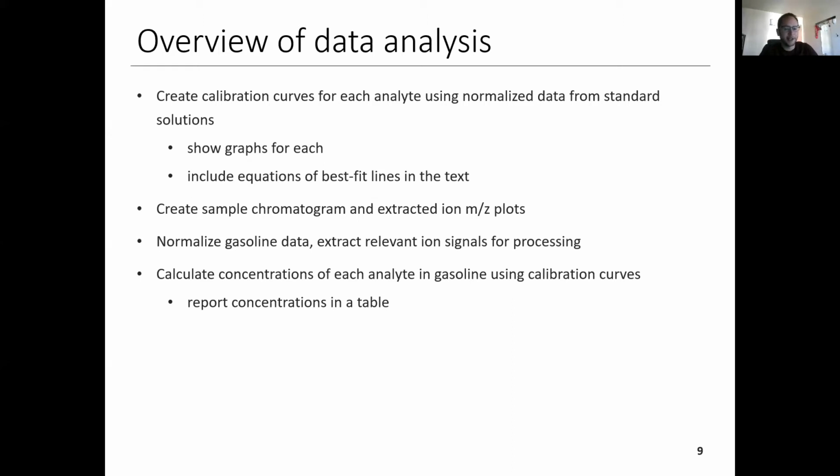So is that clear? You should still export some of the data from OpenChrom so that you can plot it on your own, but you don't need to actually do any of the peak area or retention time analysis for that data. Does that make sense? Yeah, thank you. Cool.